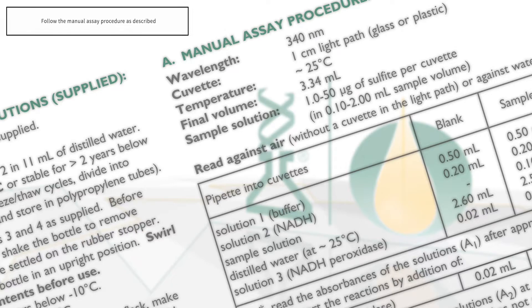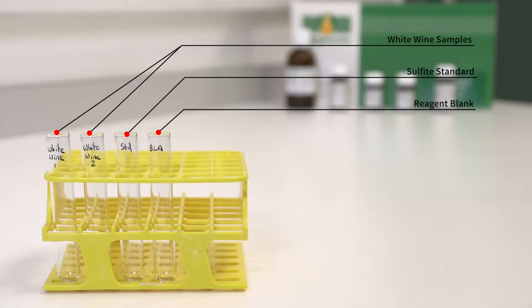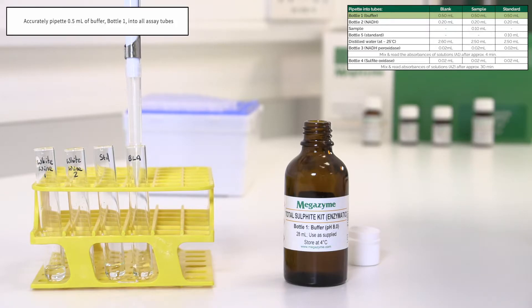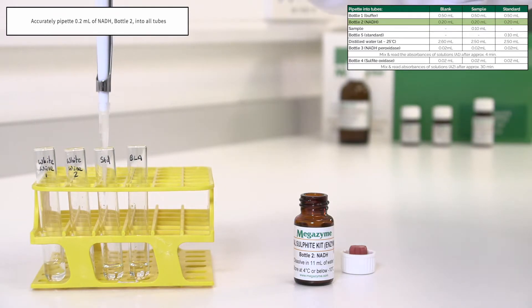Follow the manual assay procedure as described. In this demonstration we are using a white wine sample which requires no further dilution, in duplicate, along with the prepared sulphite standard and a reagent blank tube. Accurately pipette 0.5 millilitres of buffer, bottle 1, into all tubes. Accurately pipette 0.2 millilitres of NADH, bottle 2, into all tubes.